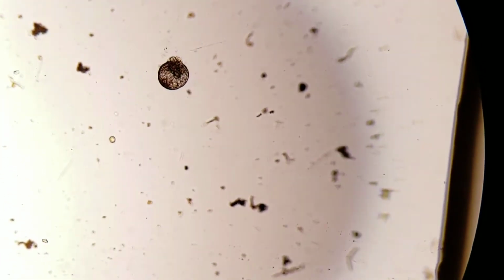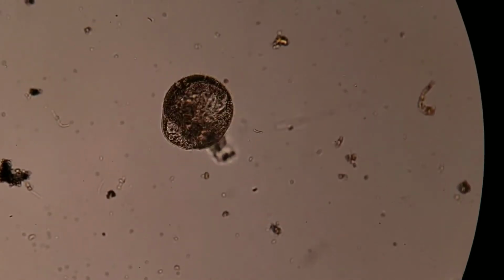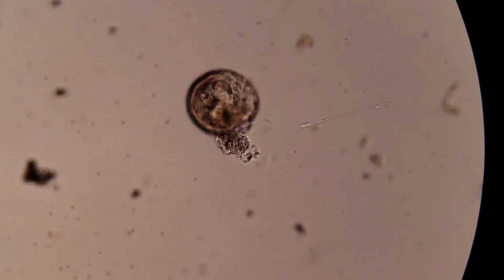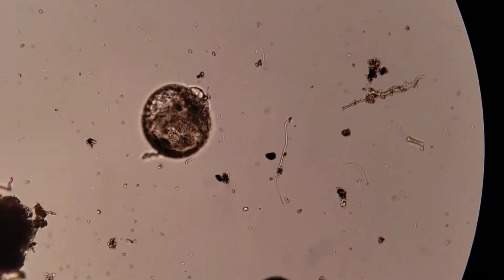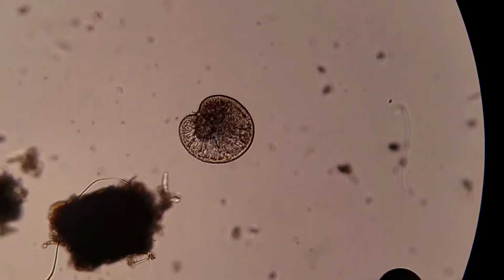What else is going to be in here? That's big, by the way. This is big, this orb. I'll take another look at him. He's like, almost has a tail that stays still, unless that's poop. Maybe he just pooped there. I bet you that's what it was. See, he definitely has a vacuole pushing out water from his rear. Just like a jet-propelled engine.